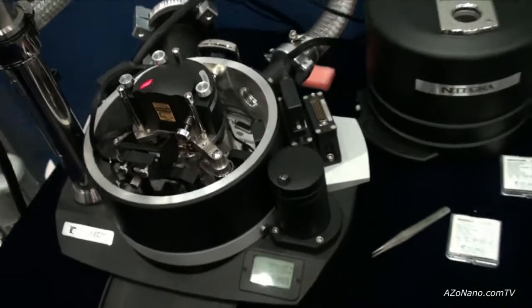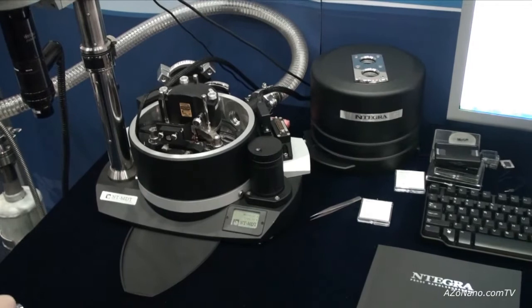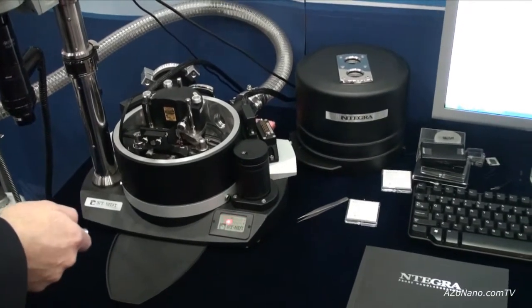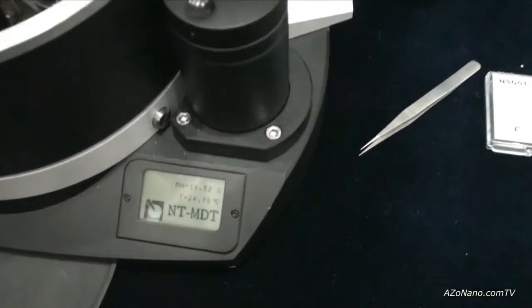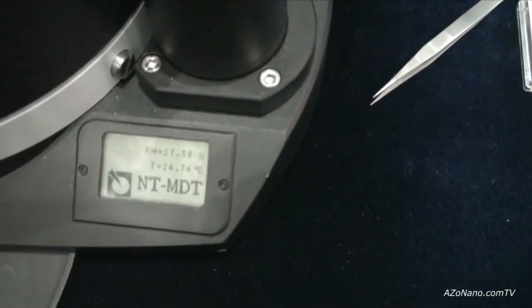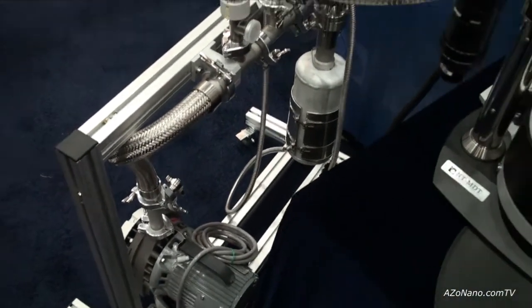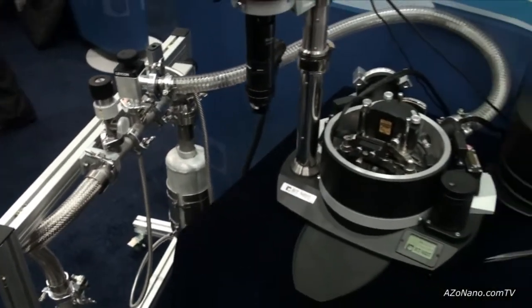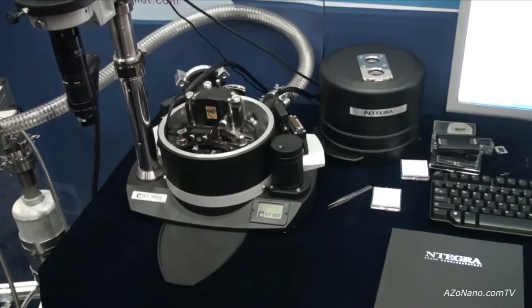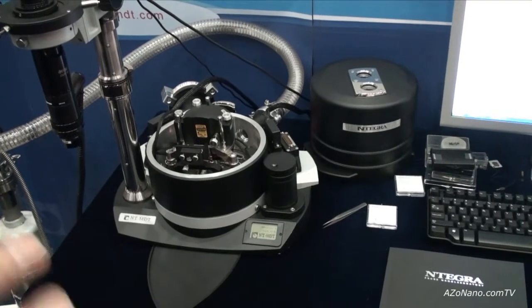In this design, the system has a special chamber which allows work in humidity control. You see here you can see humidity and temperature, or you can use this system to do measurements in low vacuum with the use of this external pump. This vacuum could be up to 10 minus 4 torr, which is more than enough to increase sensitivity for magnetic force measurements and all other two-pass techniques.